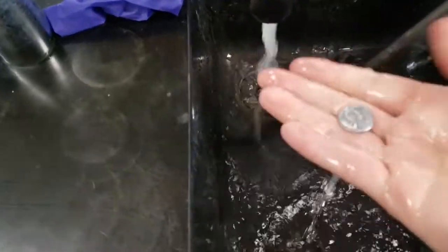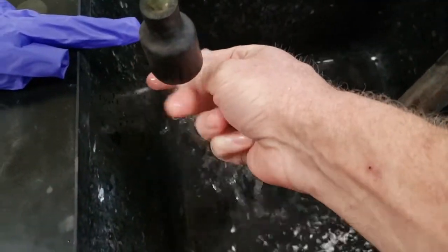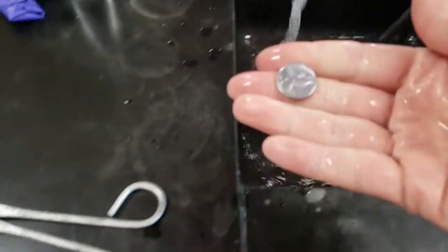I just rinse it off. I'm not trying to scrub it. I'm trying to get any of the residual base off of it, trying to get any of the pieces of zinc off of it, so it just looks like a shiny silver penny. And then I want to pat it dry if it's still wet.